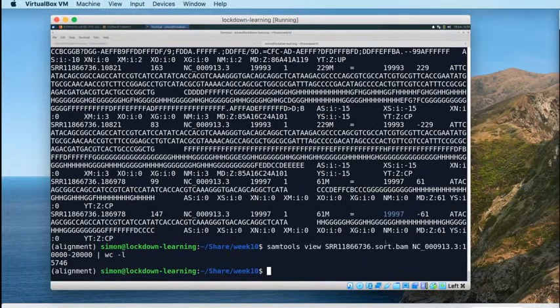And that's another advantage of, rather than just applying standard compression to a SAM file, storing as BAM and having an index. It allows us to do these nifty things which are dependent on that file format, rather than if it was gzip compressed, in which case all of this stuff would be much more difficult to do. So that's a useful thing to be able to do.